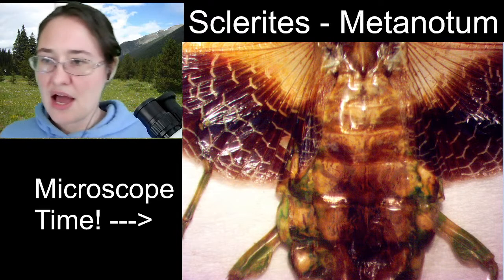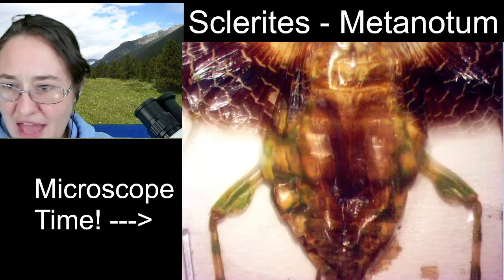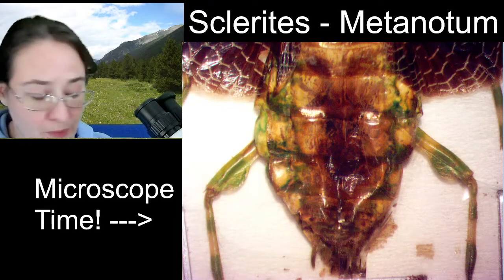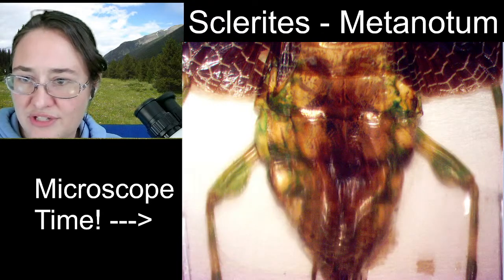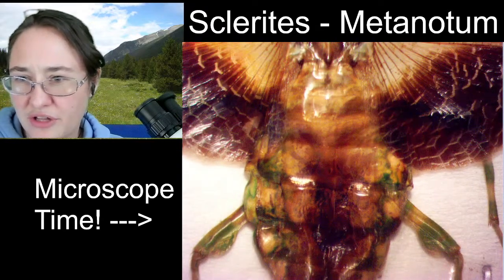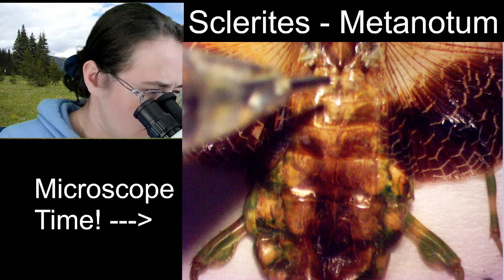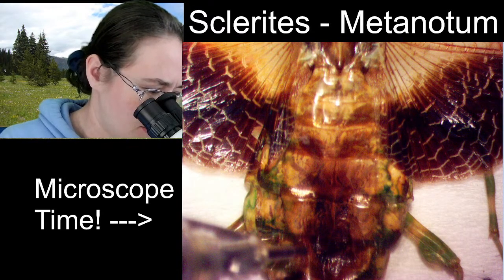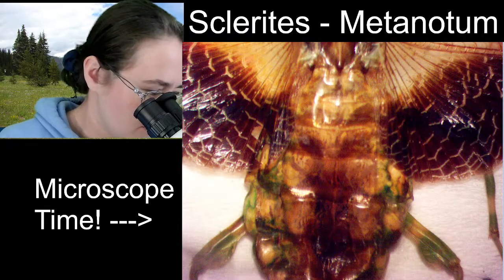Okay, so we're about to be moving into this abdomen, and the abdomen is long enough that it's not fitting under the microscope in its entirety. So I'm going to go ahead and count these segments back from the thorax. I believe I counted 8 earlier, but I'm going to recount just to make sure. 1, 2, 3, 4, 5, 6, 7. Uh-oh. What's this?